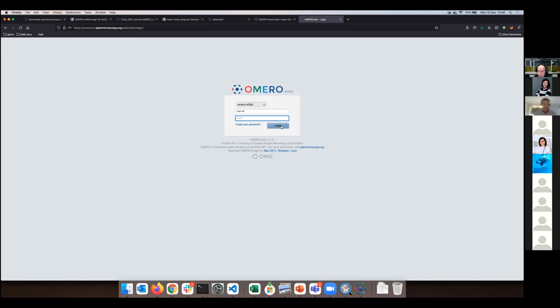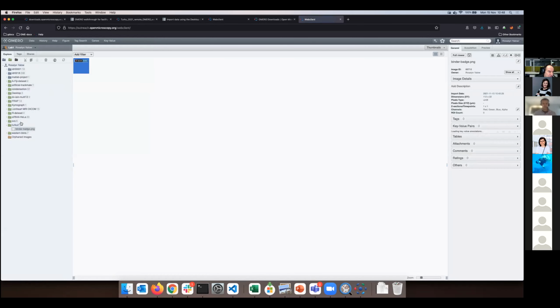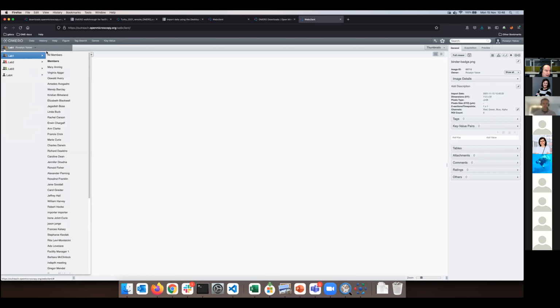And we would recommend that from the point where you imported your images, you can log into Omero Web and work on from there. Now, I just did so as user 40, and unsurprisingly, I'm here in my portfolio. I can see what I imported in Turku, etc. So I hope that you managed to log into Omero Web now. And I will now go and show you where are we.